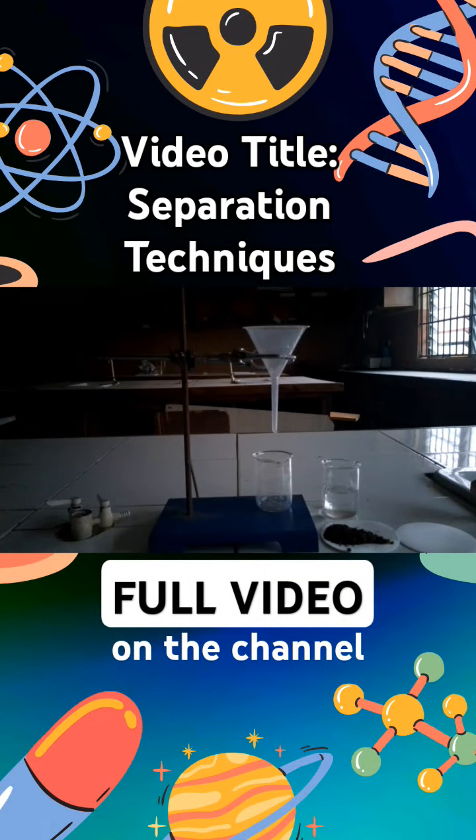We are going to start with this simple experiment. This process is known as the filtration process. If you don't know the meaning of filtration, don't worry yourself. We are going to talk about it in detail later in the video. So filtration, just know that filtration is a separation technique.